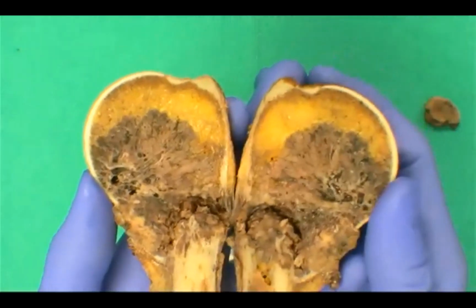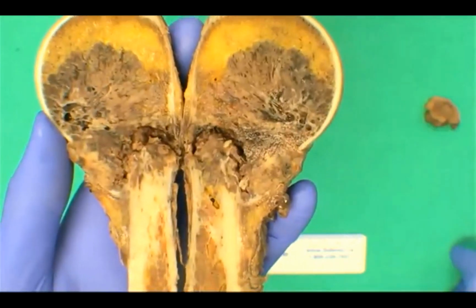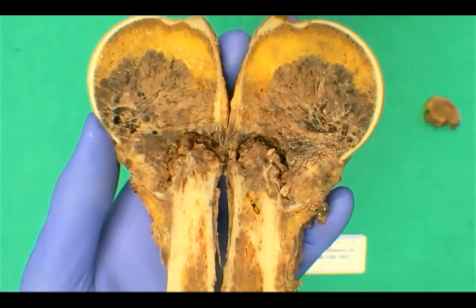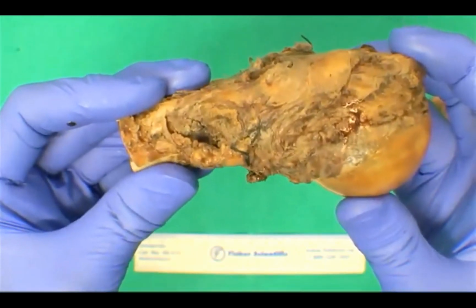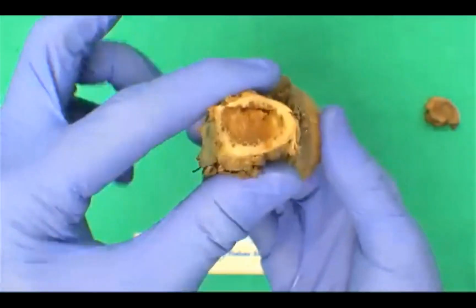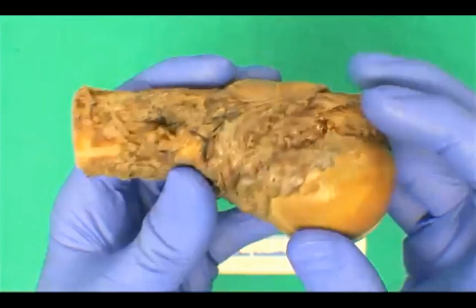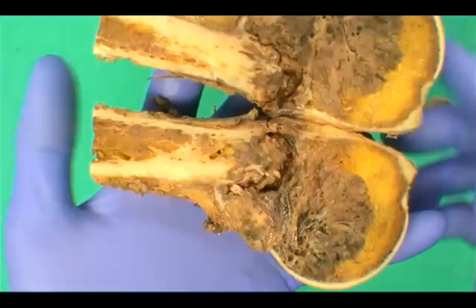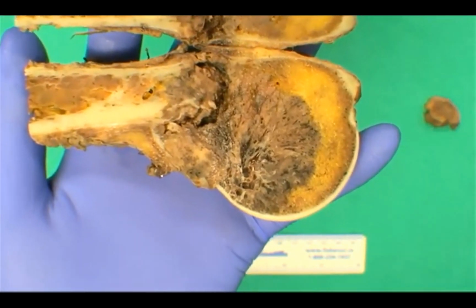In terms of a gross for this particular specimen, the approach isn't too much different than any other gross description. We're going to measure the humerus in 3 dimensions. You can measure the diameter of the humeral head, measure the size of the distal margin. Going into the gross, we can talk about a lot of these different words: soft and cystic, hemorrhagic lesion.